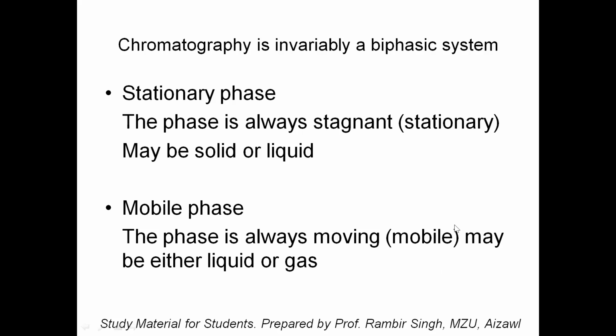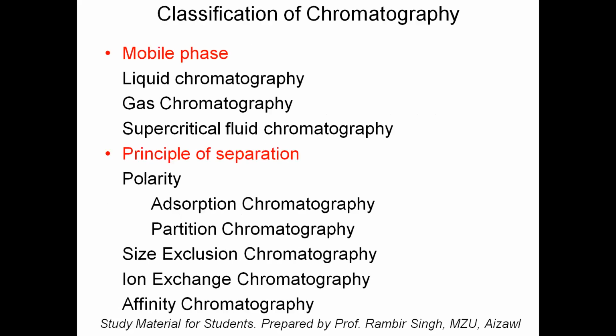Using the same concept, we prepared the supercritical fluid chromatography. Now, the advantage of supercritical fluid chromatography is that you can use it for the separation of food grade components, number one, and number two, there is no need for evaporation of the solvent at a later stage, right?